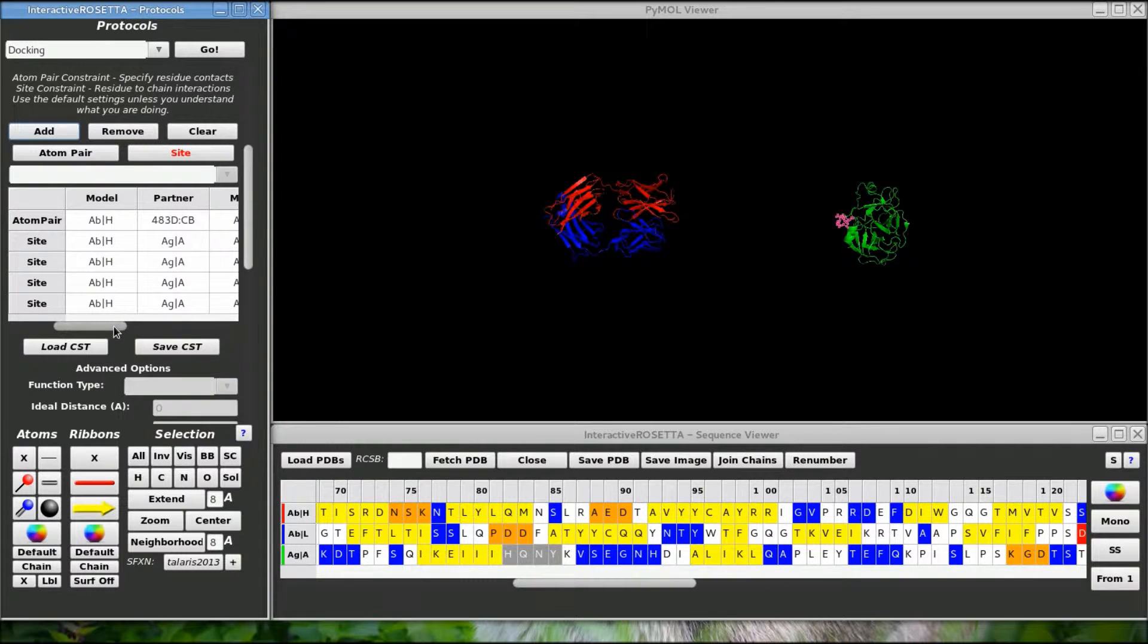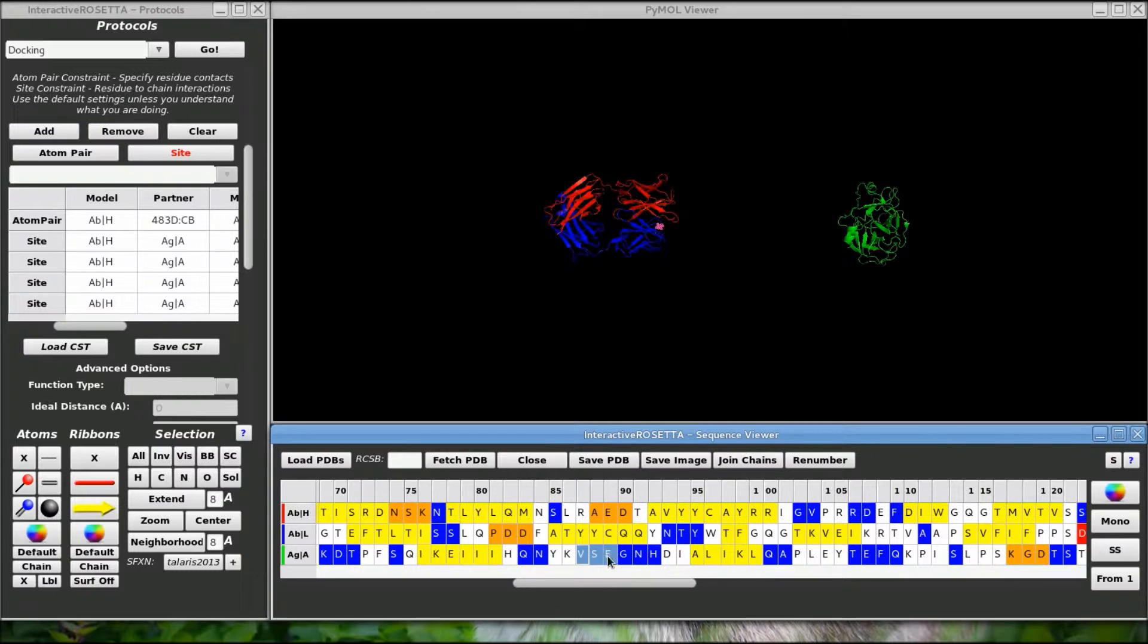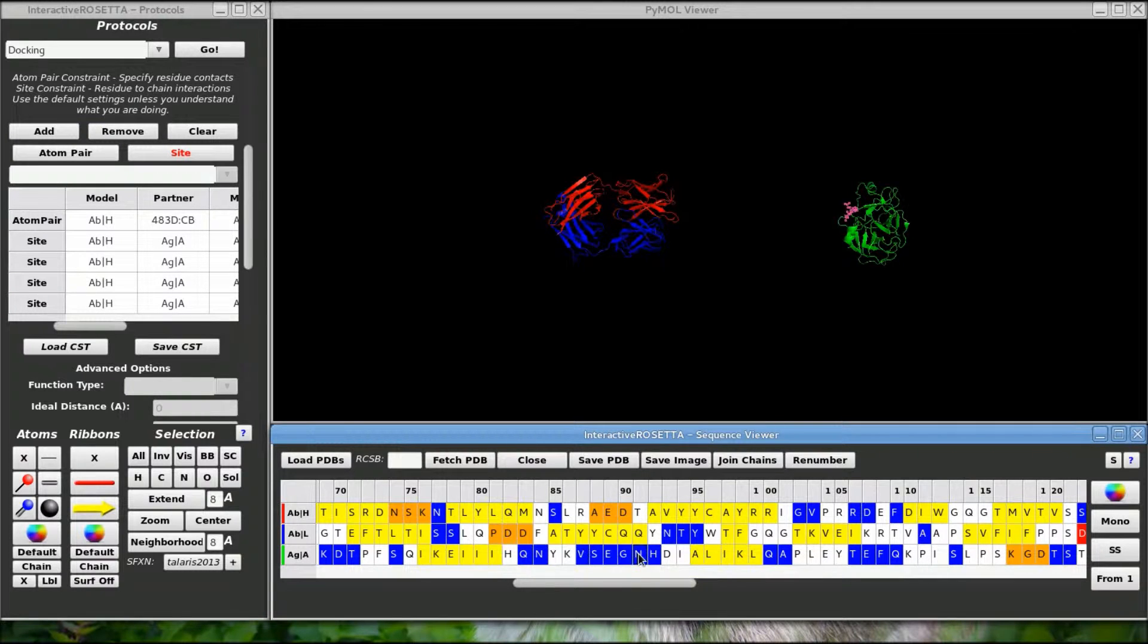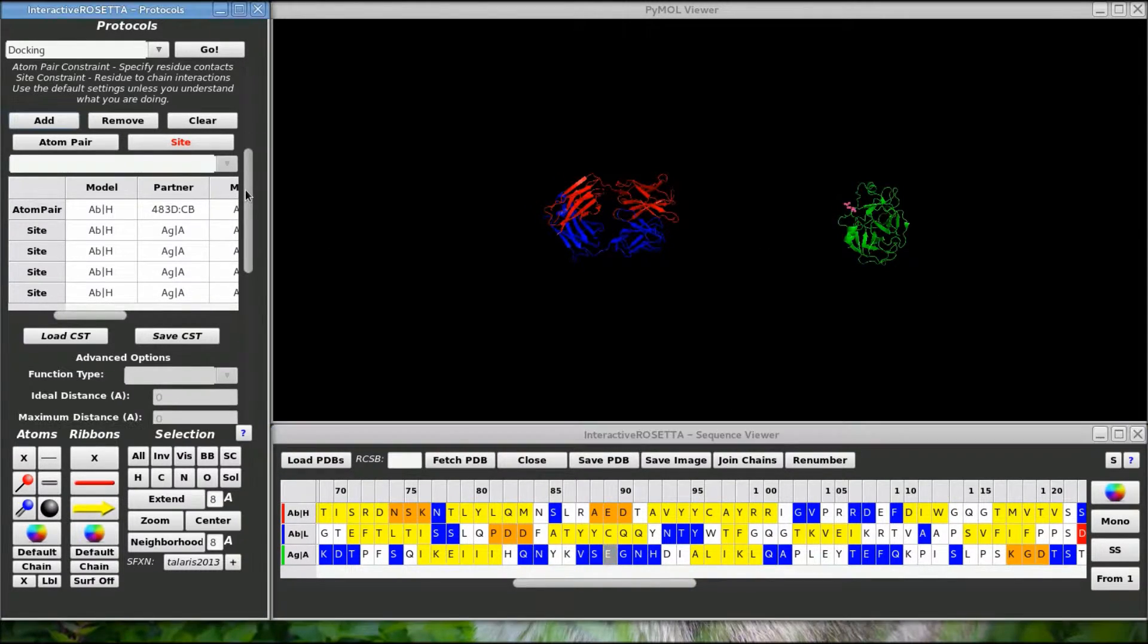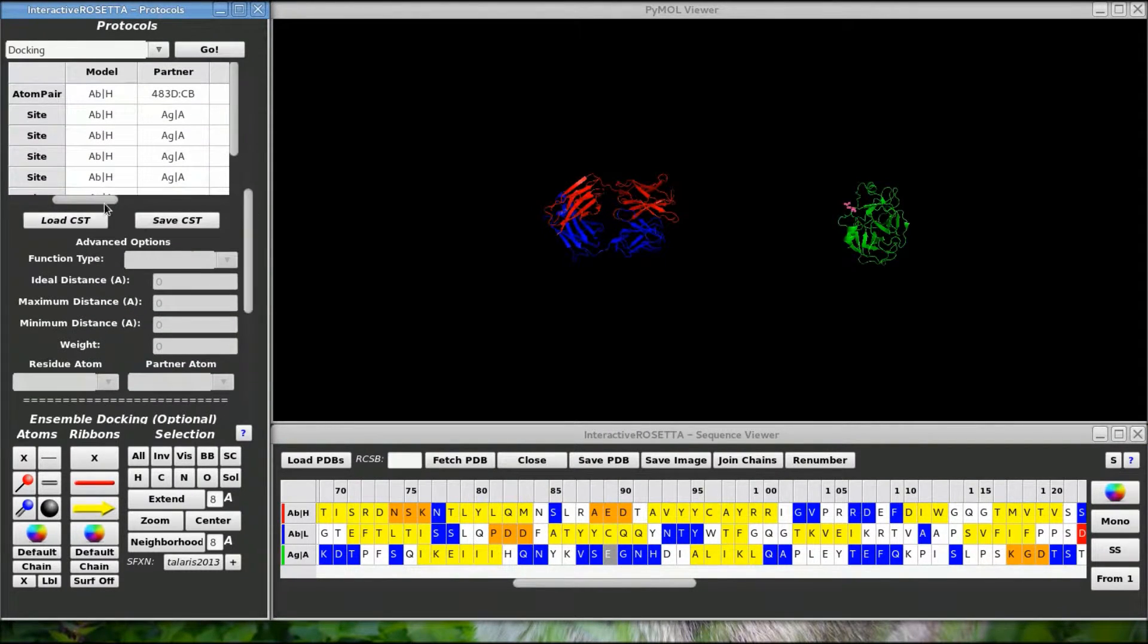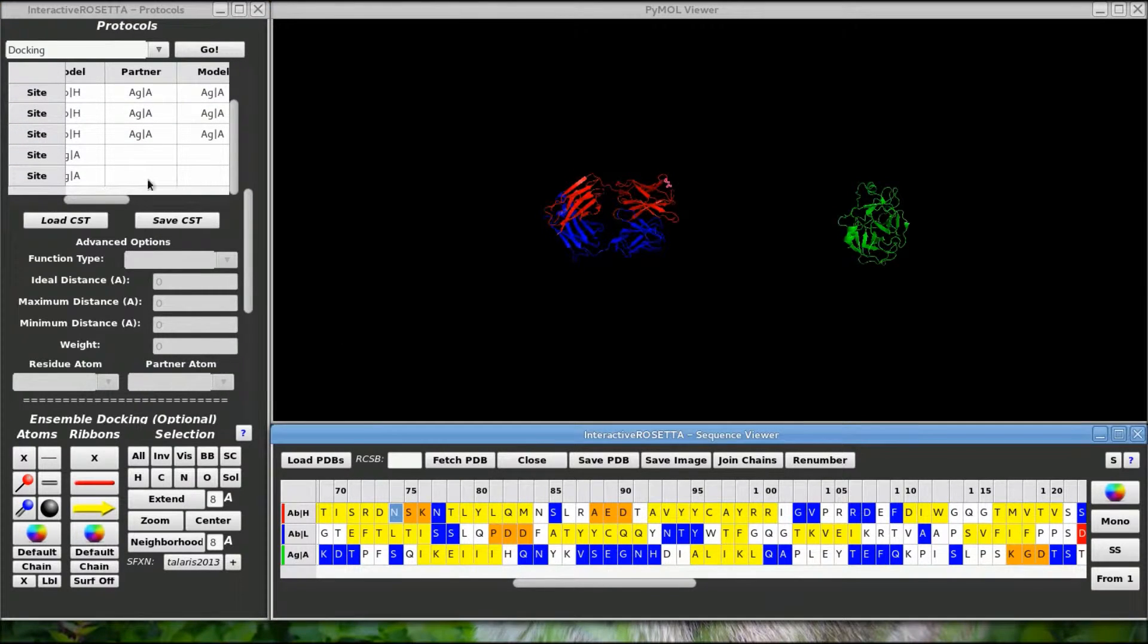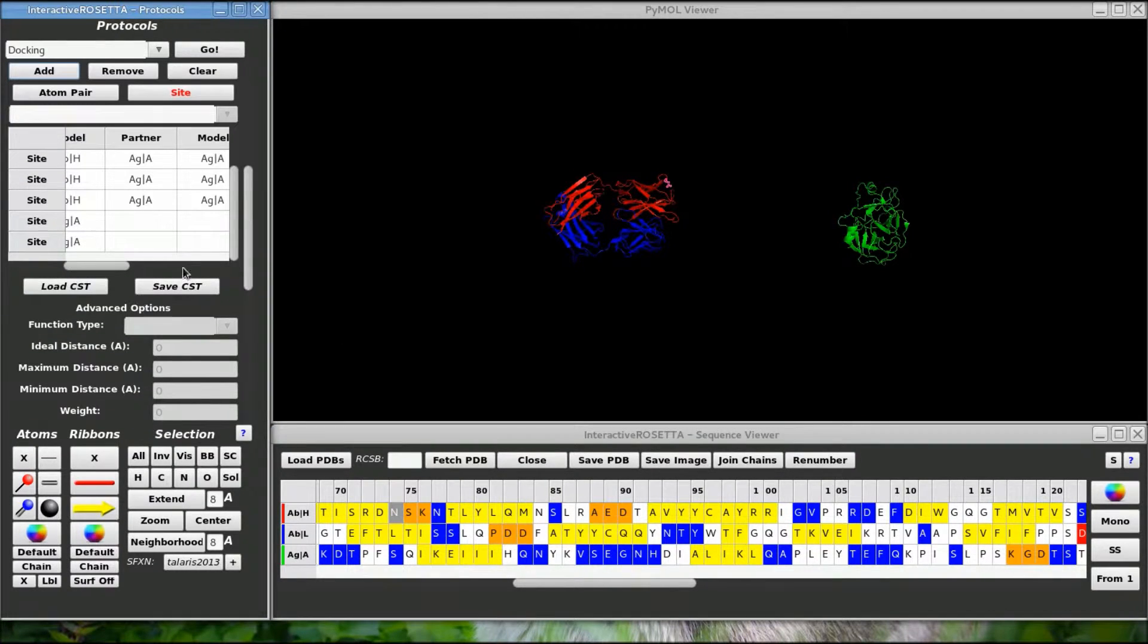But what if I wanted to go in the other direction? I might know that this residue is on the epitope so it interacts with either the light or heavy chain, but I don't know which chain it interacts with, so let's add it twice and specify one as interacting with a heavy chain and one with a light chain.